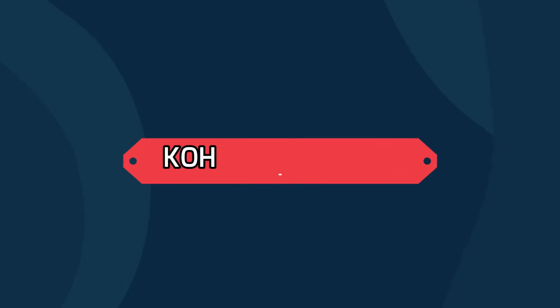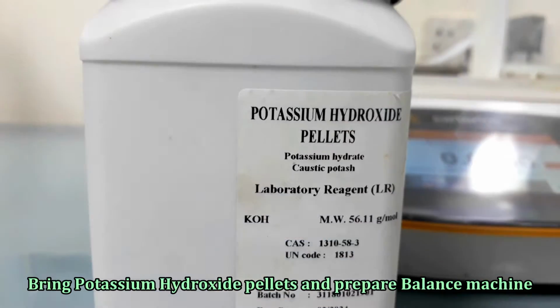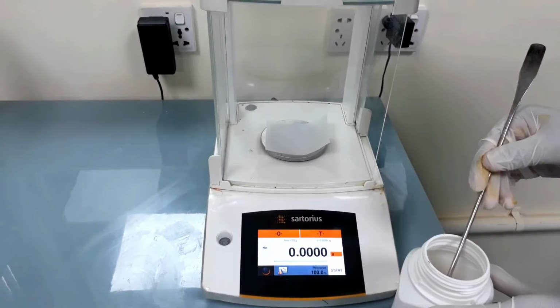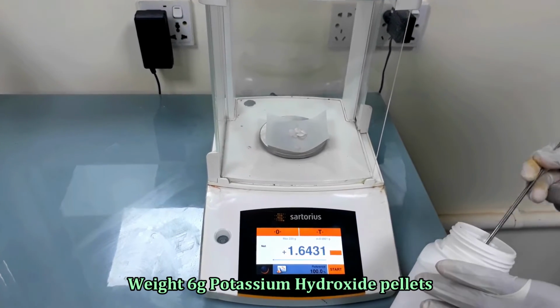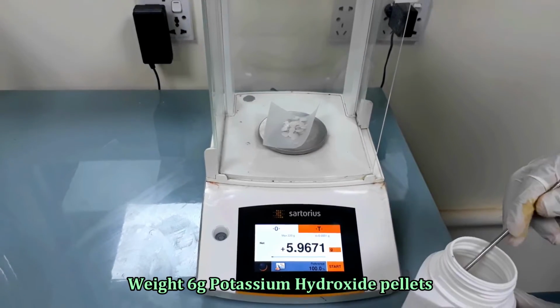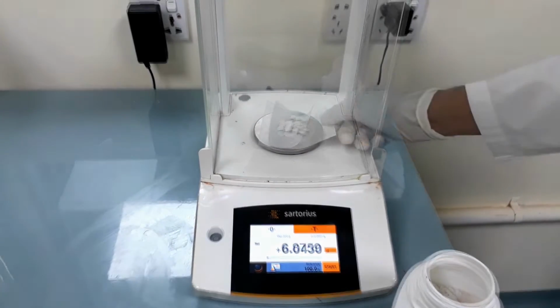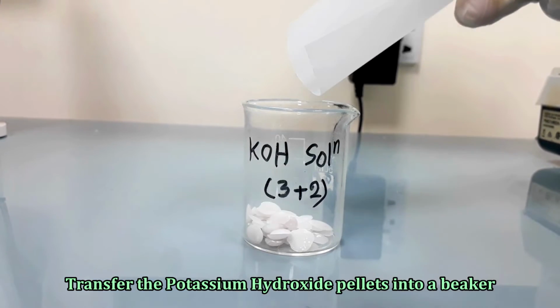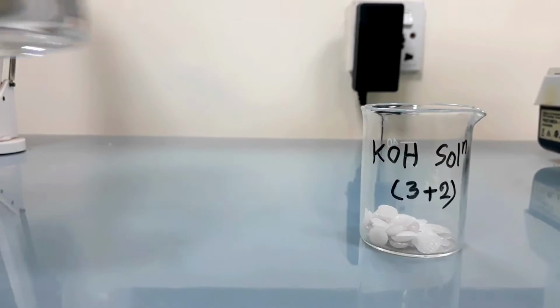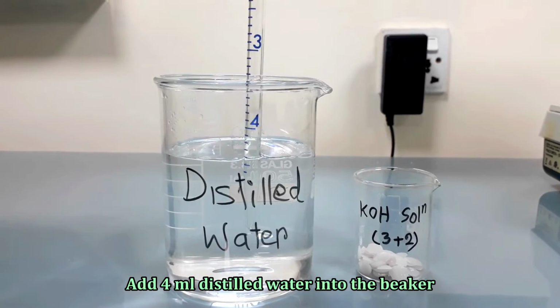For the preparation of potassium hydroxide 3+2 solution, take 6 grams potassium hydroxide pellets into a glass beaker. Add 4 ml distilled water into it.